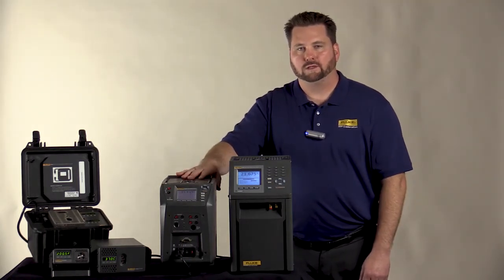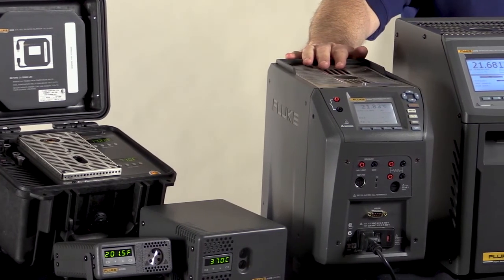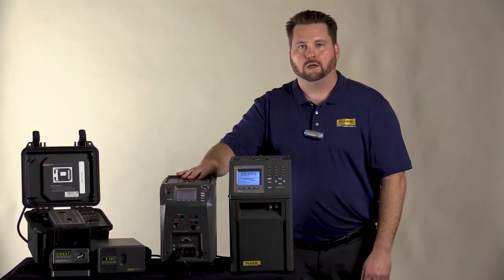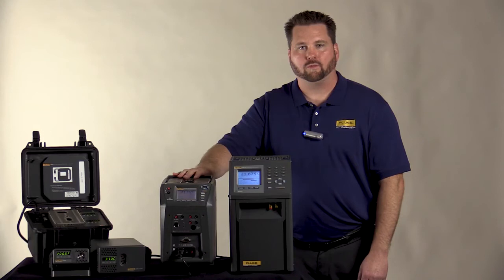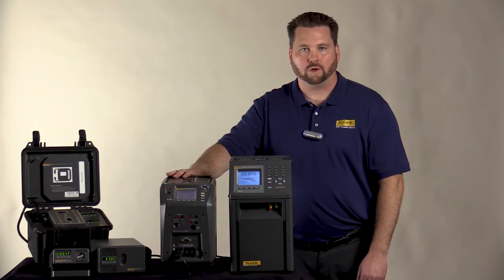Our 914X series, depending on which model you choose, we have three to look at: the 9142, 9143, and 9144. You can think of them as the low, medium, and hot of the units. The 9142 allows you to go as cold as minus 25, while when you move to the 9144 unit, you can get as hot as 660 degrees C.